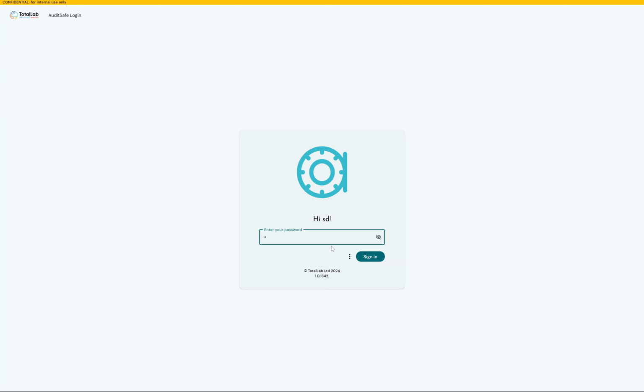It's worth noting as well that, because this is a high-level scalable solution, we can provide AuditSafe in a Docker container. So we can have it on a virtualized network, sitting separate in its own Docker container. That's very useful for DevOps and large IT teams in the global pharma companies that we typically work with.